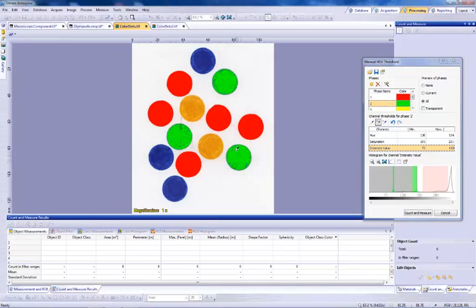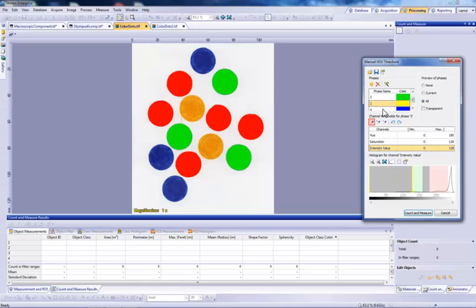Continue to hold the left mouse click and move over the rest of the color range to highlight. Move to other areas to continue this selection. We now right-click to complete the dropper selection. Continuing, we will select Phase 3. We will select the new threshold dropper.